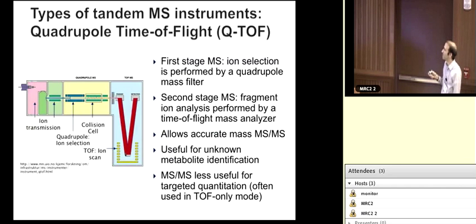Sort of the reverse is a parent ion scan, where you look at multiple parent ions, you do a collision, and then you look for everything that gives a particular product ion that's of interest. And so if you had a class of metabolites that all have the same head group on them, then they might fragment the same way, and you might look at that using this sort of thing. The most, I'm sorry, this should be called multiple reaction monitoring, or SRM or MRM. I apologize for that. That should read SRM and also MRM. Both terms are used somewhat interchangeably.